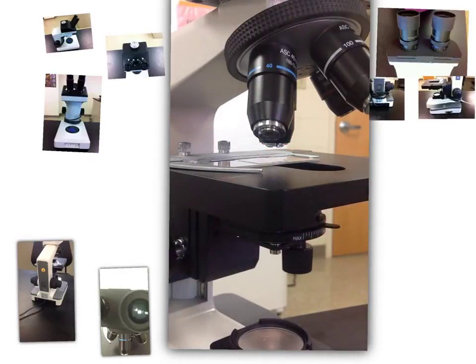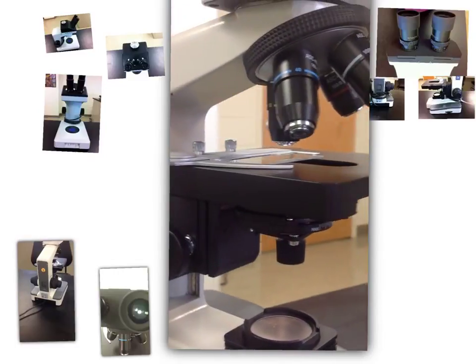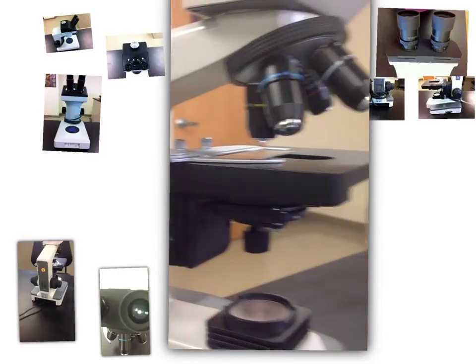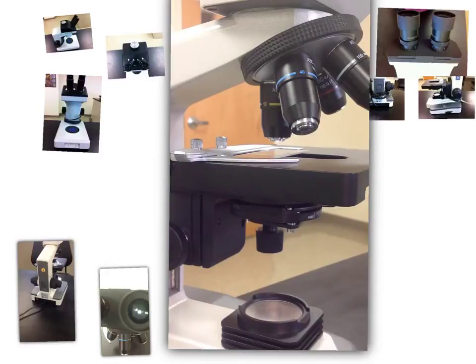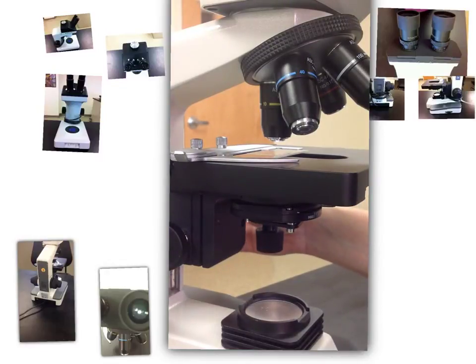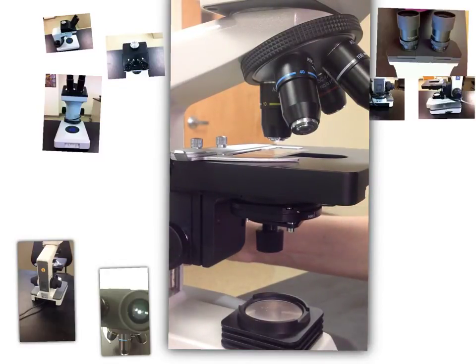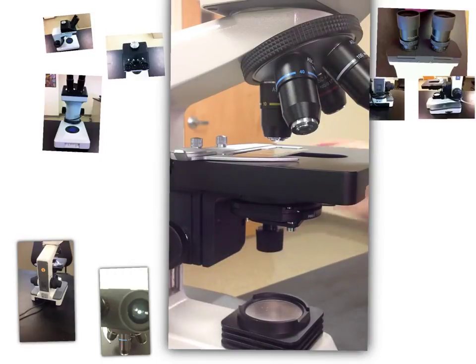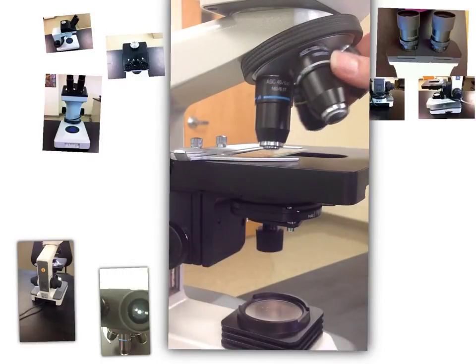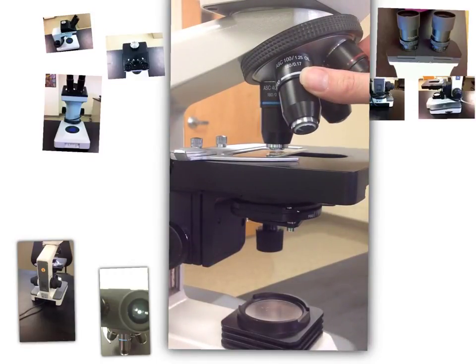So I'm using the fine adjustment to make sure that it's in focus. Let's take a look, I'm on 10, so this will give me a magnification of 100. And then if you take a look, a lot of people get really scared right about now. They're going to say, oh no, I'm going to hit. And then they back off. You don't want to. As long as you are in focus, that's okay. You're never going to hit as long as you are in focus.